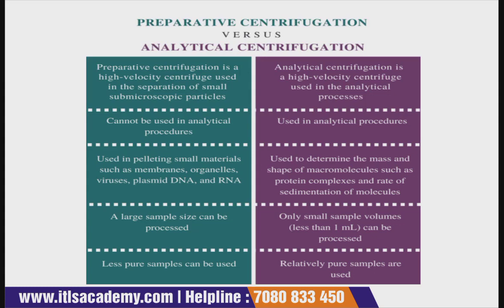Whereas analytical is used to determine the mass and shape of macromolecules, for example protein complexes, and the rate of sedimentation of molecules. Then preparative says a large sample size can be processed, whereas analytical says only small sample volumes less than 1 ml can be processed. Then preparative says less pure samples can be used, whereas analytical says relatively pure samples are used.